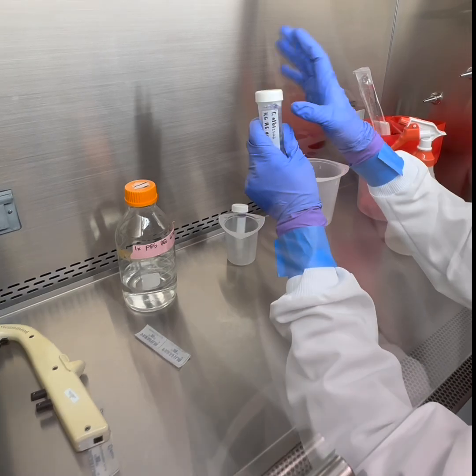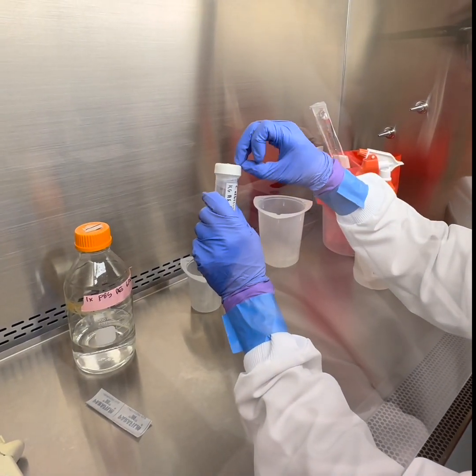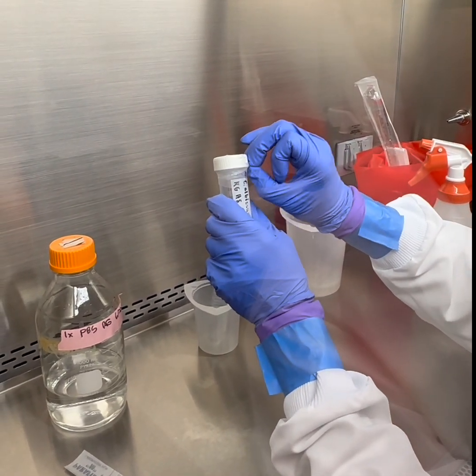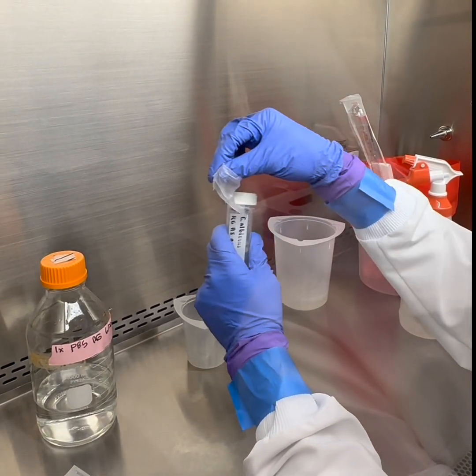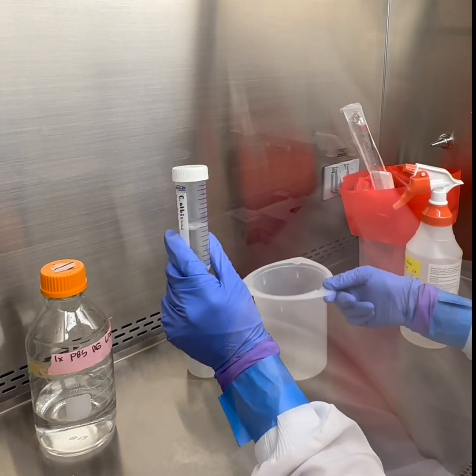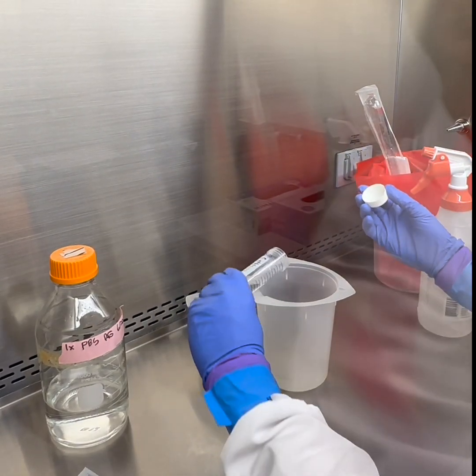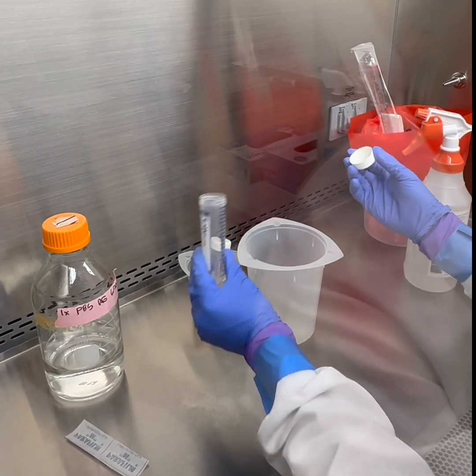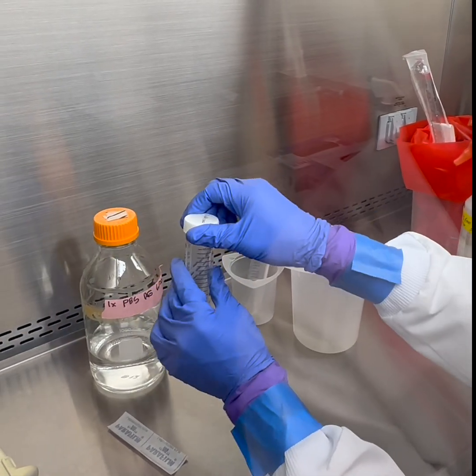Whenever we're spinning this down, we want to parafilm the top to create a seal. You may also want a rotor that seals on top of this to avoid colonization of your laboratory. So this is a tightly packed pellet. I'm just going to decant. No need to use a pipette at this point. Easy peasy. This is into bleach. Just have some bleach at the bottom of this. Recap, that pellet's still intact.